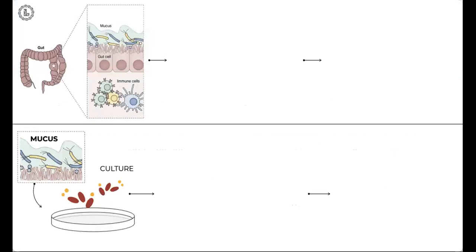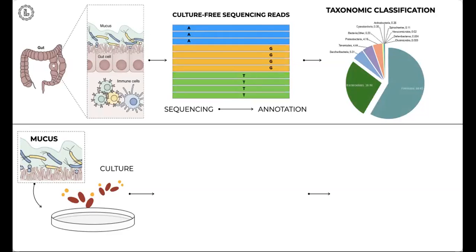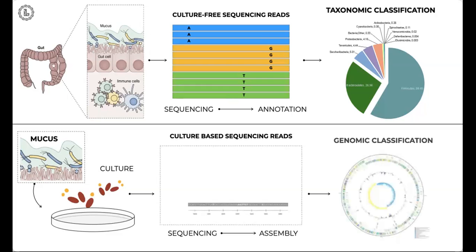So practically, how we would approach this is, for example, with the microbial community in the gut. We can look at the microbial community in the gut by taking a fecal sample as representative of the gut environment, or we can also take a cecal sample tissue by scrubbing the intestines. From these samples, we want to organize the proportions of specific types of microbes by comparing their specific sequences from our samples to the known types of bacteria in a database. This approach helps us identify the taxonomic classification of the members in our sample.